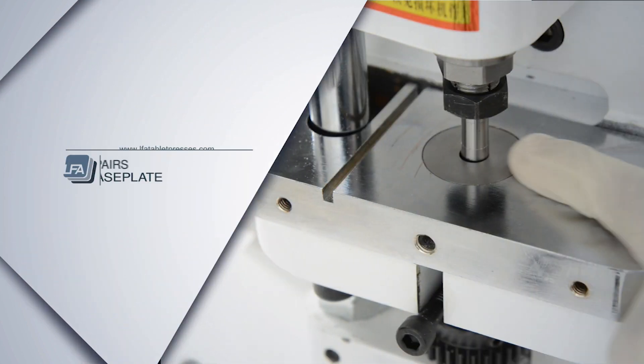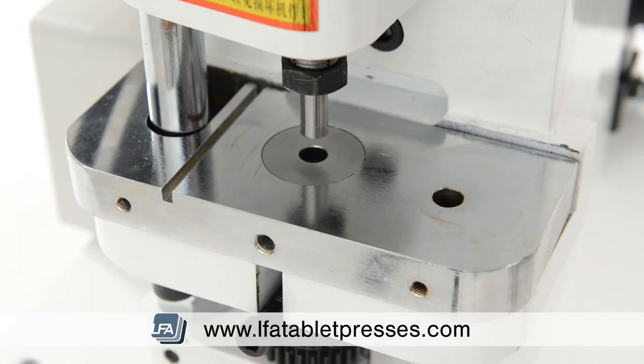Welcome to Elevate's guide to adjusting your base plate when it's out of line. If your base plate is out of line, this could potentially damage both your upper punch and your die. Damaging your tooling can be expensive and lead to imperfect tablets.